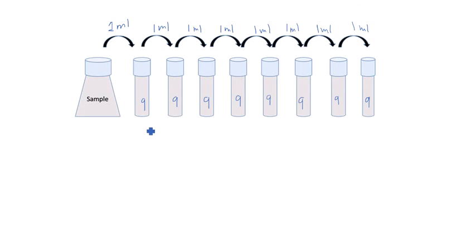Hello, in this video we are going to talk about tenfold dilution, and on your screen you have a diagram of an original sample. It could be a soil sample or sewage sample, and what we are doing is diluting this sample to reduce the number of bacteria in the original sample.